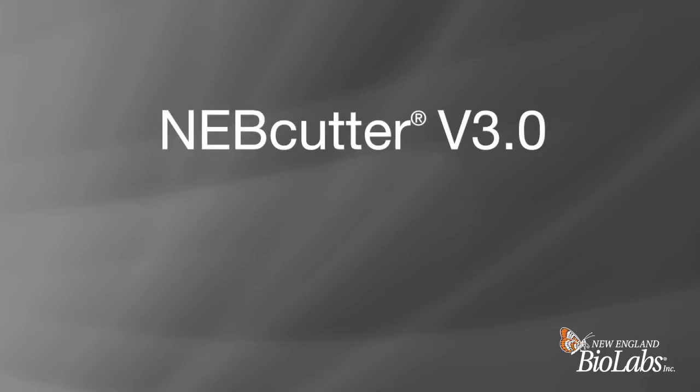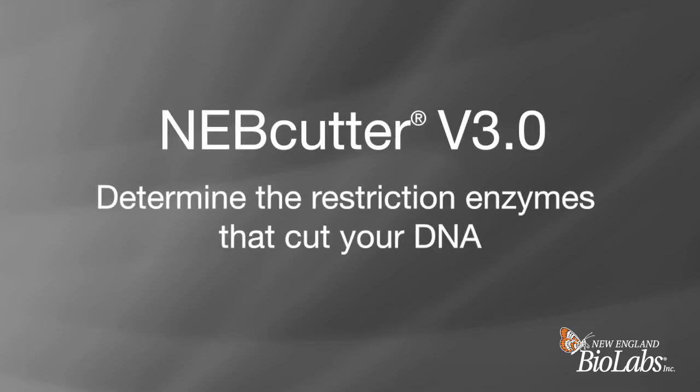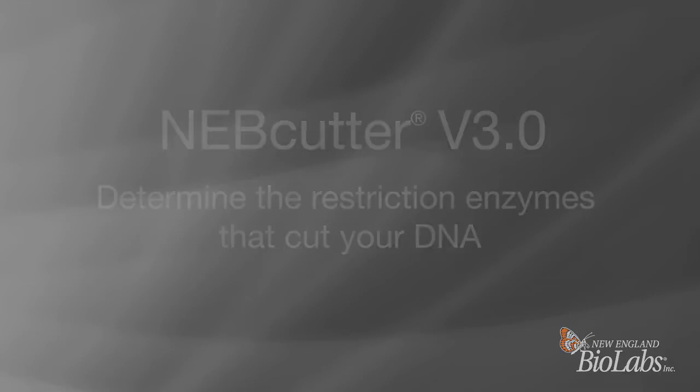NEBcutter is a free tool that is used for restriction enzyme analysis. There are many different ways to use the tool. In this video, you will learn how to find out which restriction enzymes can be used to cut your DNA sequence a specific number of times.